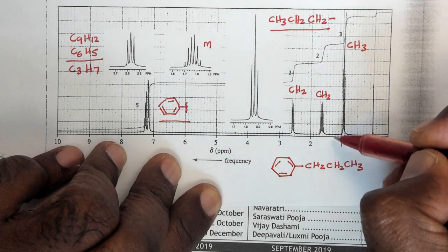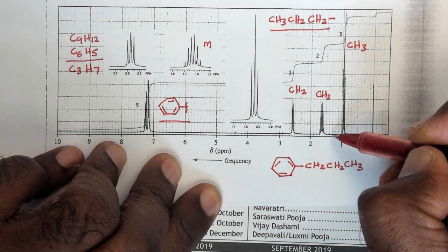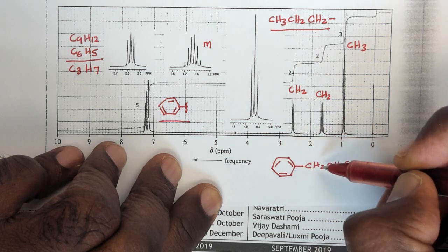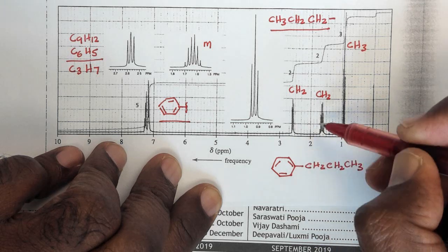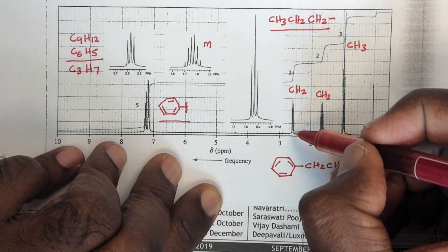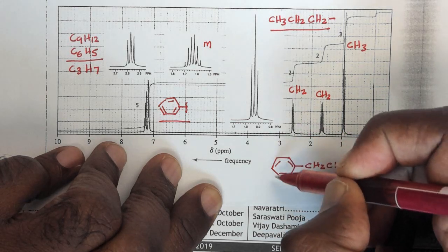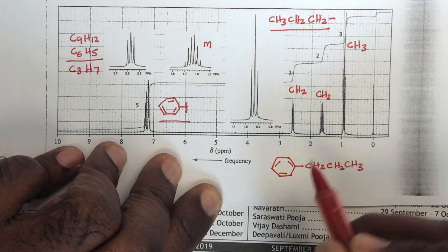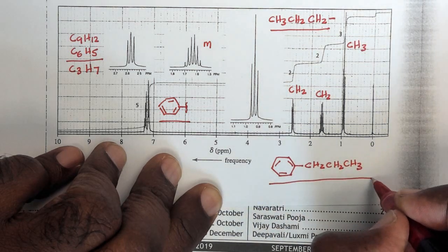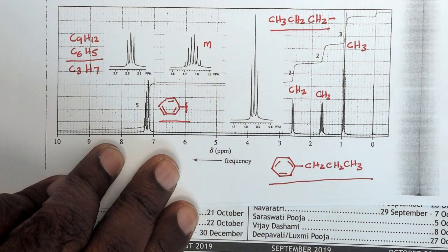The middle CH2 is sort of in the chemical shift for the methylene region. It's slightly deshielded because of this aromatic ring, which is about 2 bonds away, but this CH2 directly bonded to the aromatic ring is much more deshielded than it should be, and that's because of the pi system of the aromatic ring. So that's your structure for this particular spectrum.